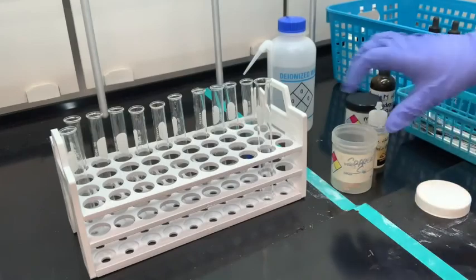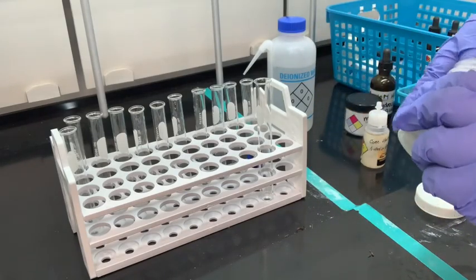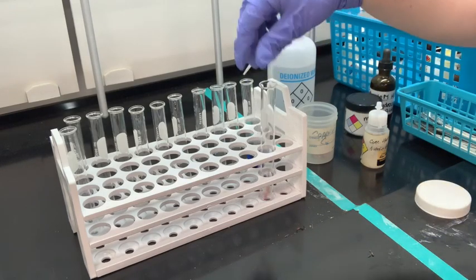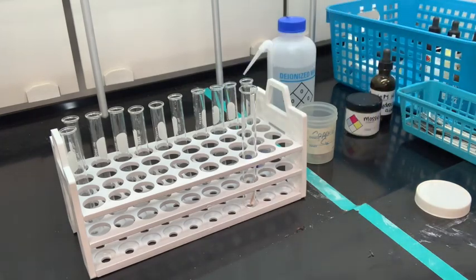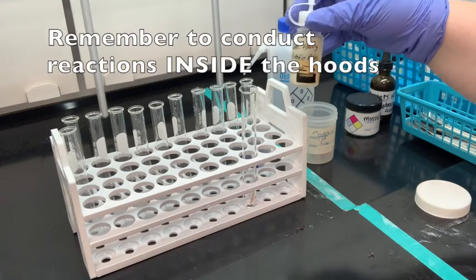So I have copper in my little container here. I'm going to use just one piece of it, and I'm going to put it in my test tube. Okay, so I have that piece of copper in the test tube, and I also have concentrated nitric acid. Again, we're handling all these chemicals inside the hoods today.